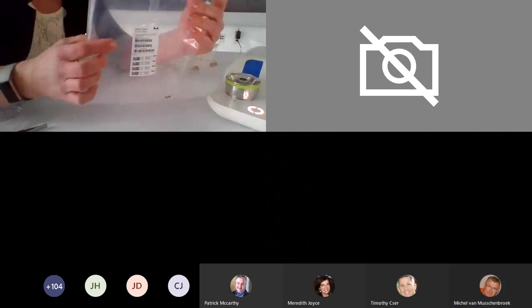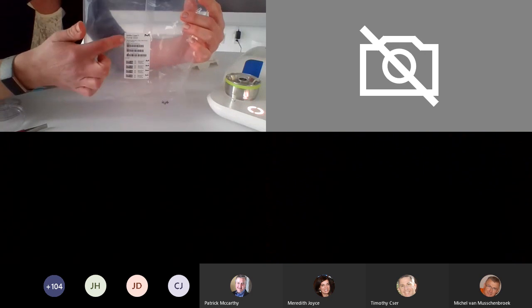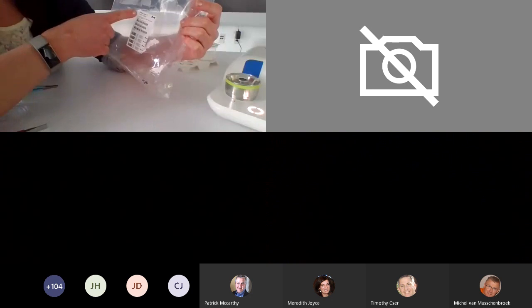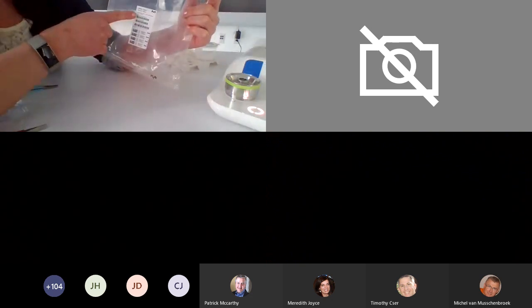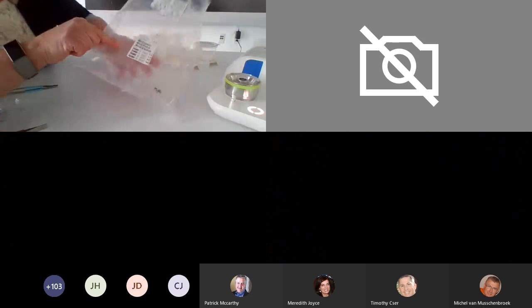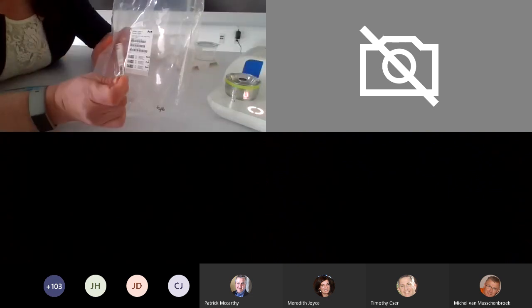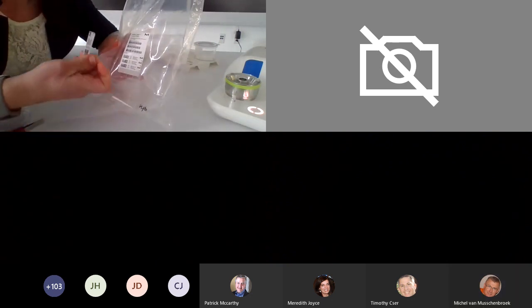The other thing to note on the outside of the packaging is where we have all of our information — this is where we talked about traceability. So here I've got my Milliflex Oasis funnel, 100 mils, the composition, mixed cellulose ester, 0.45 microns, white gridded. I've got my catalog number, lot number, expiration date, and then all these little barcode labels here. I can peel this right off and put it wherever I need to in my documentation.